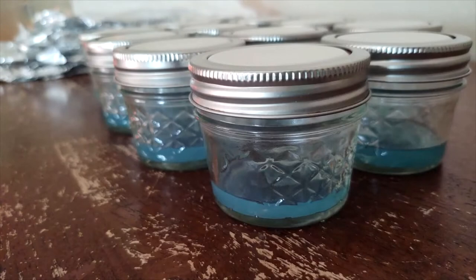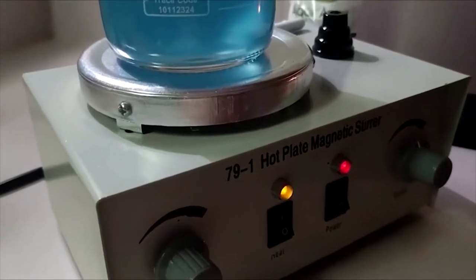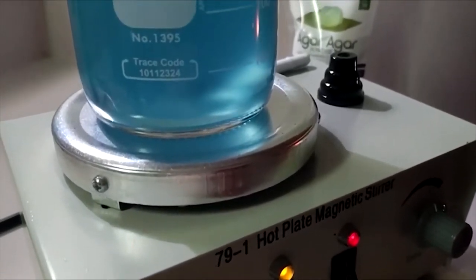You may have seen our water agar video where we share our base agar recipe. It is simply agar and boiling purified water.